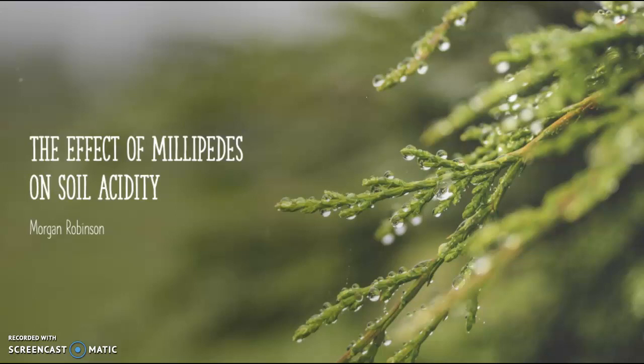Hi everyone, my name is Morgan, and for my experiment in bio, I decided to test the effects of millipedes on soil acidity.